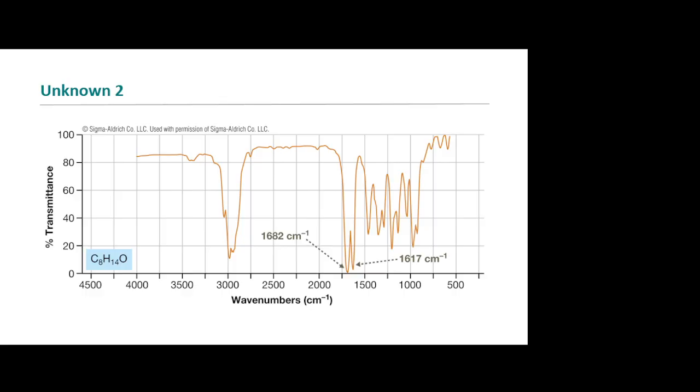Okay, so if we have a carbon-carbon double bond, that would be an alkene functional group, right? Is there a place you can look for an infrared band that would be associated with the stretch of an alkene functional group? So we'd go to our table, we'd look at alkene functional groups. What's the wave number range on our table?